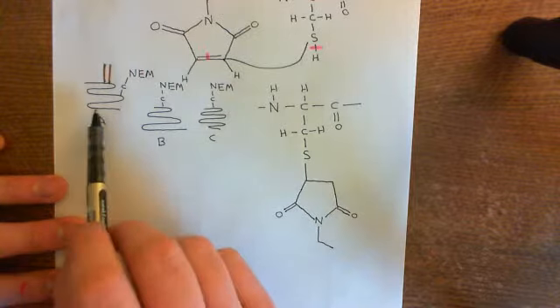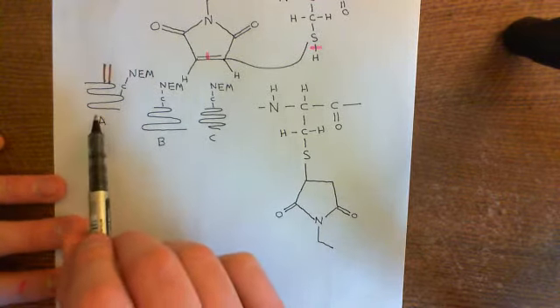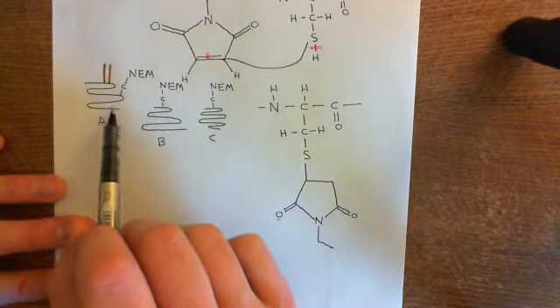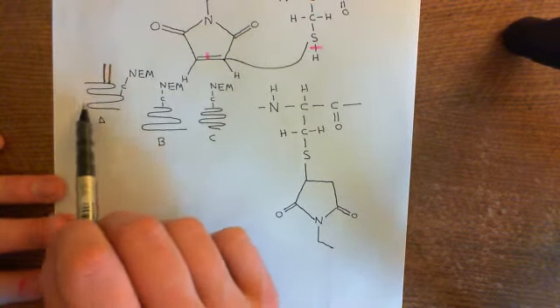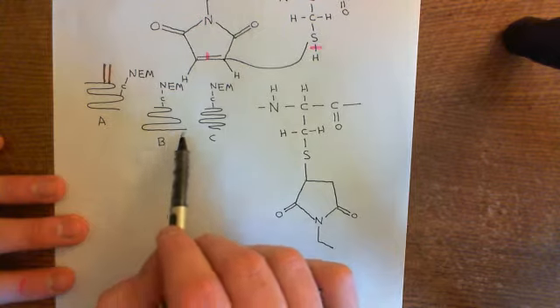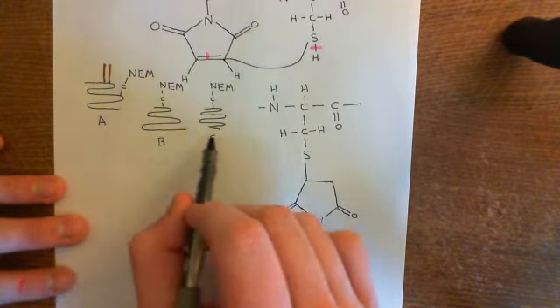Even though I've just drawn the sample as 3 proteins, in reality there'll be far more than just 3 types of protein, and also in our sample there'll be multiple of each type of protein. So for instance, there will actually be hundreds and thousands, if not gazillions, of A molecules, and thousands, millions, billions probably of B molecules, etc.